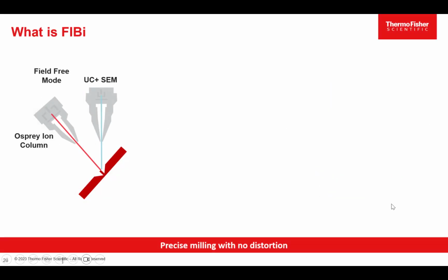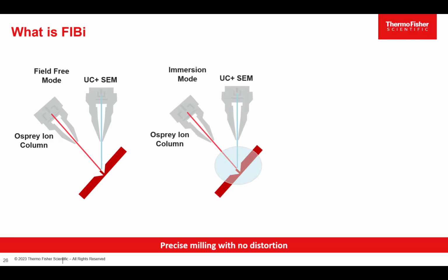So in the past, when you were working with the FIB and making cuts, and then you went to turn on immersion mode, the beam would just deflect like that. So anytime you wanted to take an image in immersion mode while you were thinning with the FIB, which is exactly what you want to do at the final thinning steps of TEM prep, you want to be as high resolution in the SEM as possible to target these tiny little features that you're trying to endpoint on.